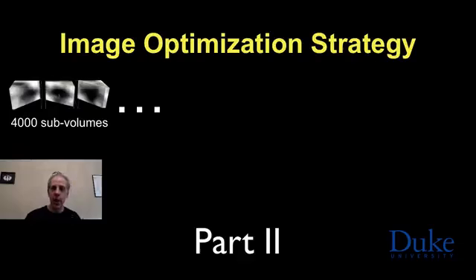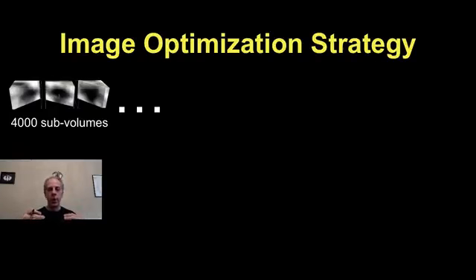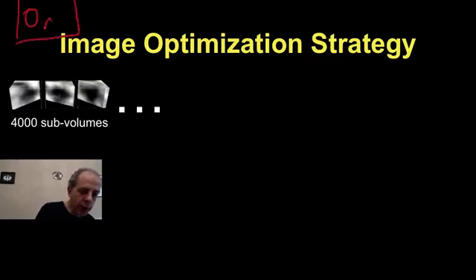That was our first step. Now we get a lot of these volumes. So we basically go into our three-dimensional data that we got from the tomograms. We have the three-dimensional data. We go and look for all the areas with the virus, and we segment out those spikes or envelopes.